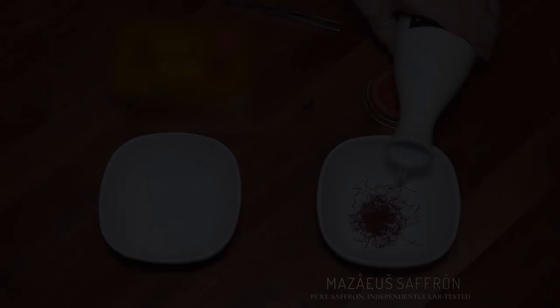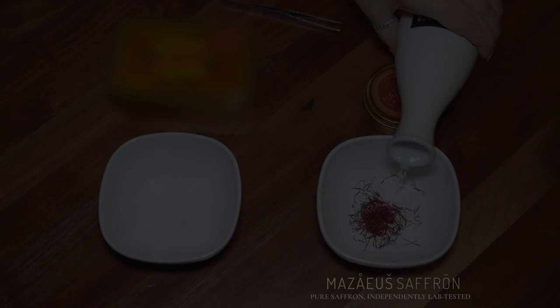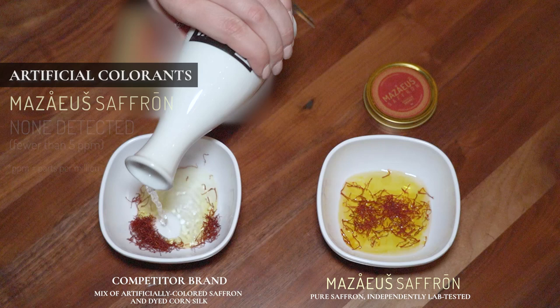Finally, the last series of tests check for 9 different artificial colorants. A quality saffron should have absolutely no presence of artificial colorants. The coloring properties of authentic saffron should come solely from its crocin.